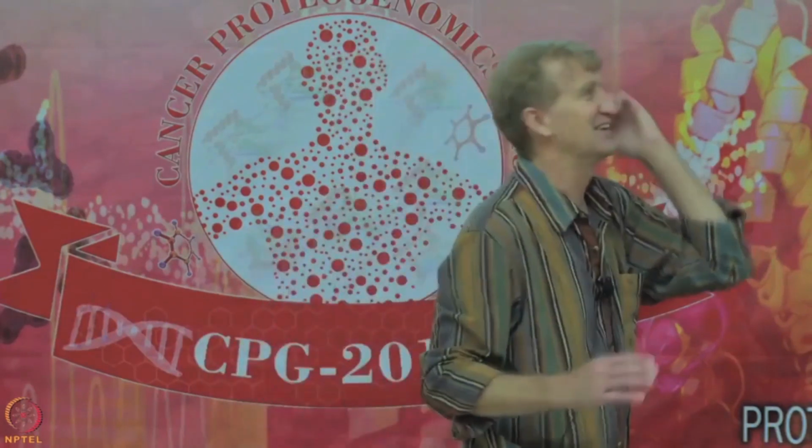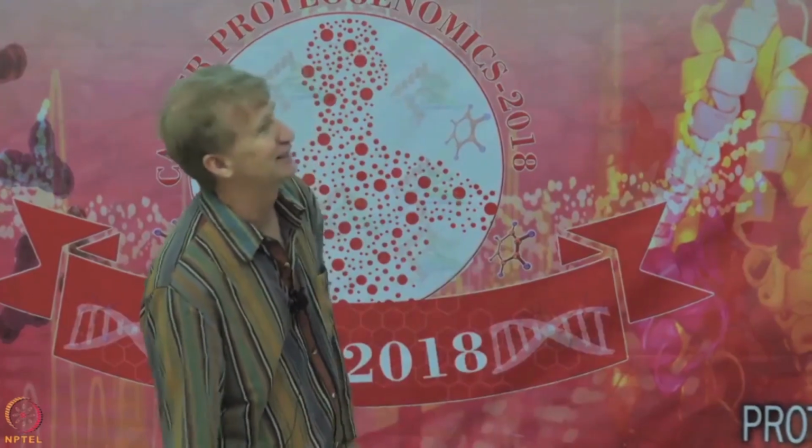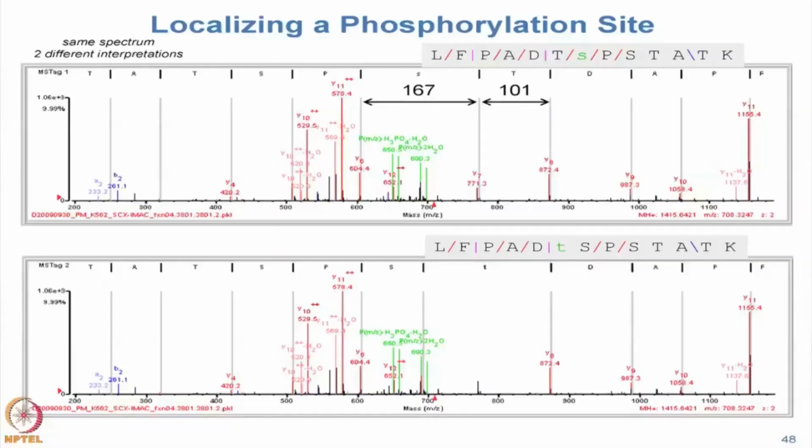Okay. All right. So the answer is yes, there's a serine. And you should have been able to vote, because you don't have to know anything to see that when you look at the labeling, there's something that's not assigned here, and it is assigned here. But let's talk about what is assigned and why.